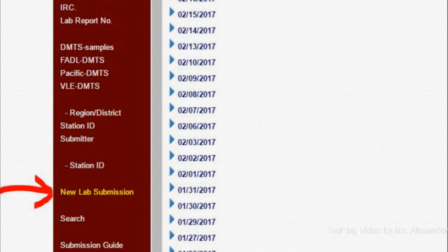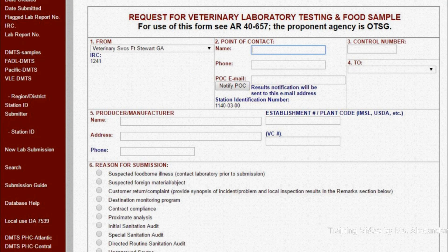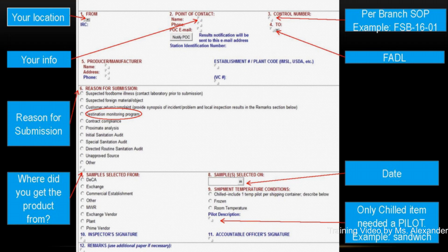Once you click the New Lab Submission tab, the window will show up to input your information and the product information. This is mostly self-explanatory. However, Block 5, Producer or Manufacturer, is very important and you must pay close attention. This will be discussed later.